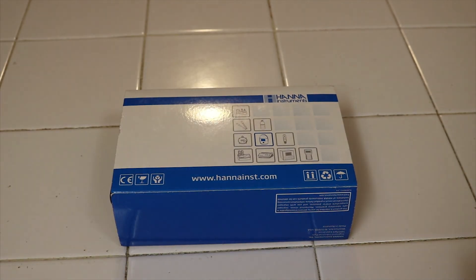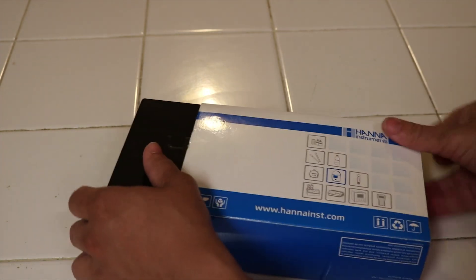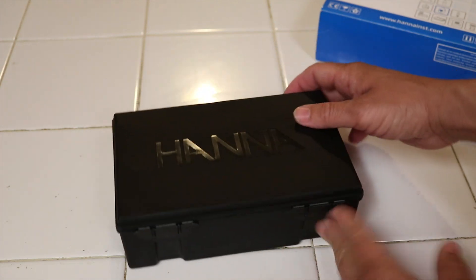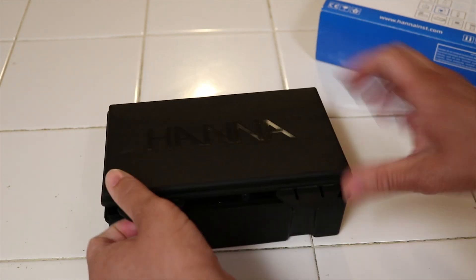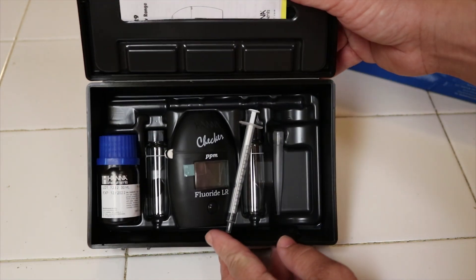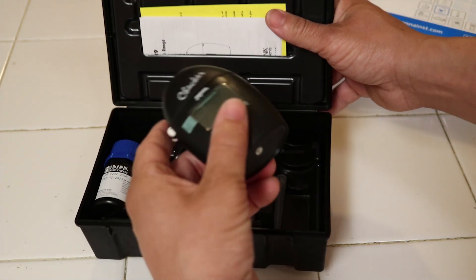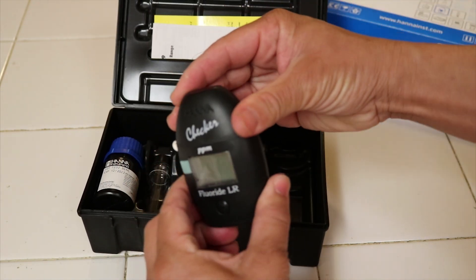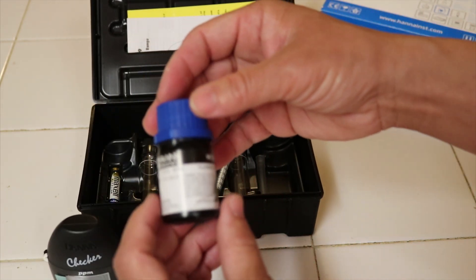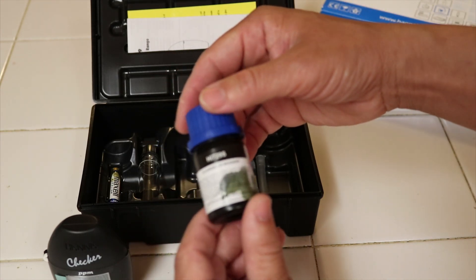We're gonna go ahead and open it and see what we got inside. I'm gonna try and stay in frame here. Looks like we got the fluoride device here. That says fluoride LR Reagent.